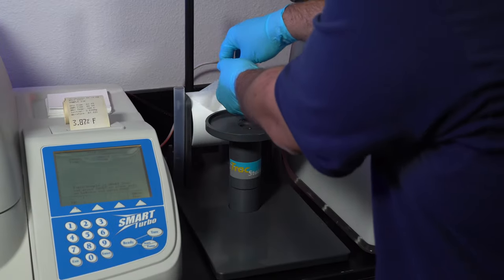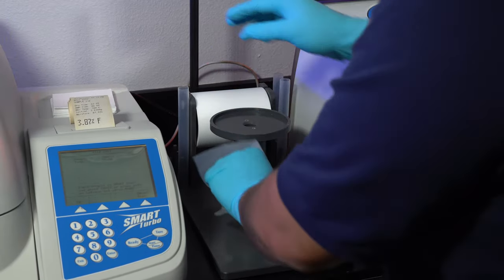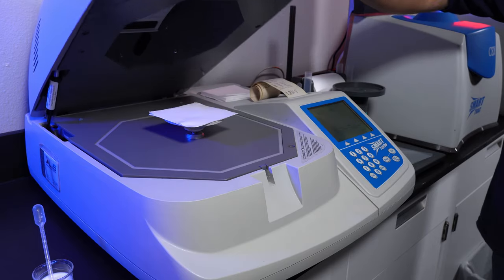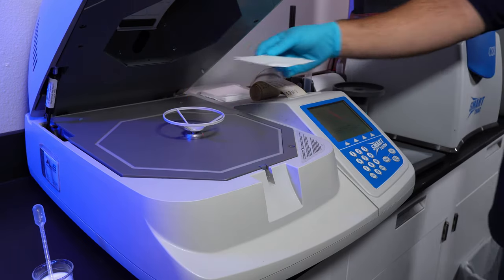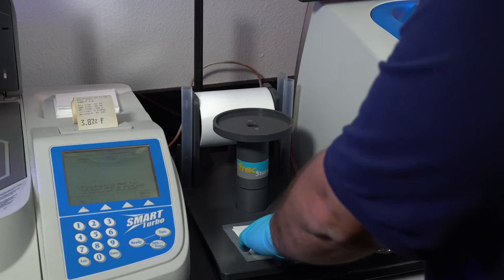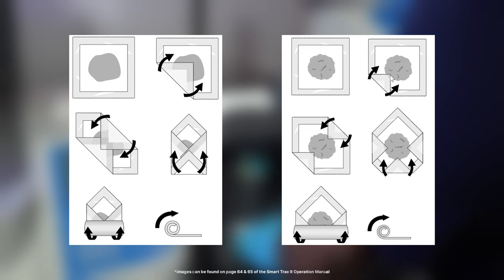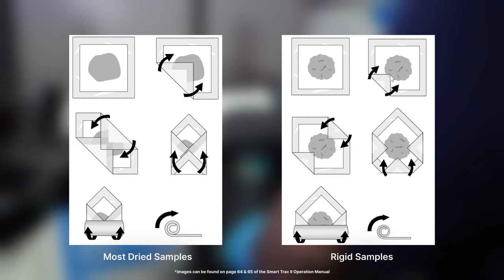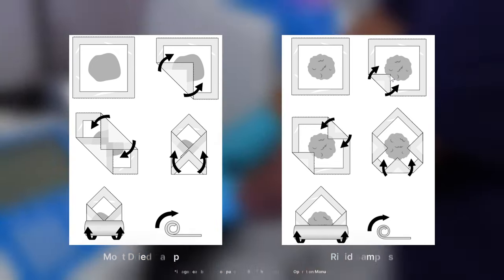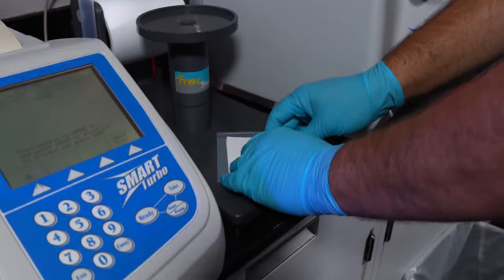Now we'll slide over to the SmartTrack Station. Pull one piece of the SmartTrack film and place it on the flat surface on the station. Grab your sample pads and place them onto the film. There is a specific way to roll up the film — here are the two diagrams. The left diagram will work for most dried samples and the right diagram is specifically for samples that are rigid and hard to fold. We'll be folding our sample the usual way.